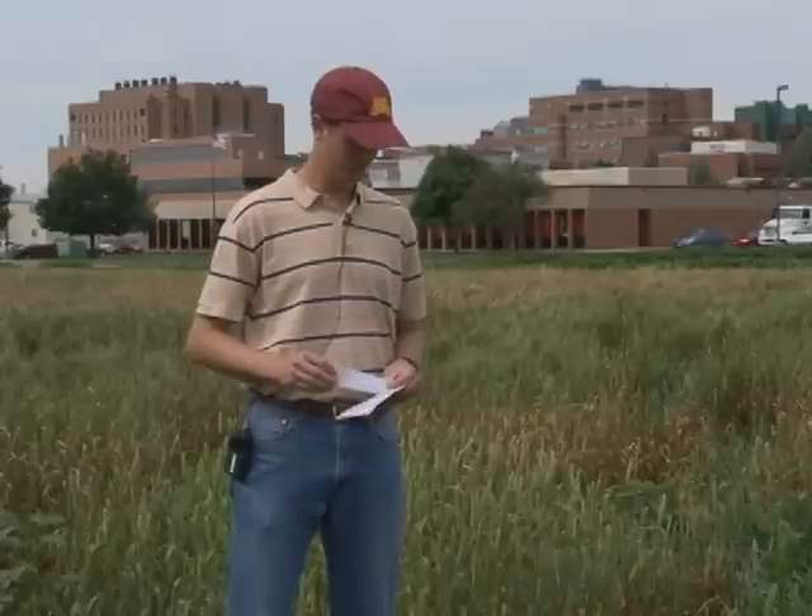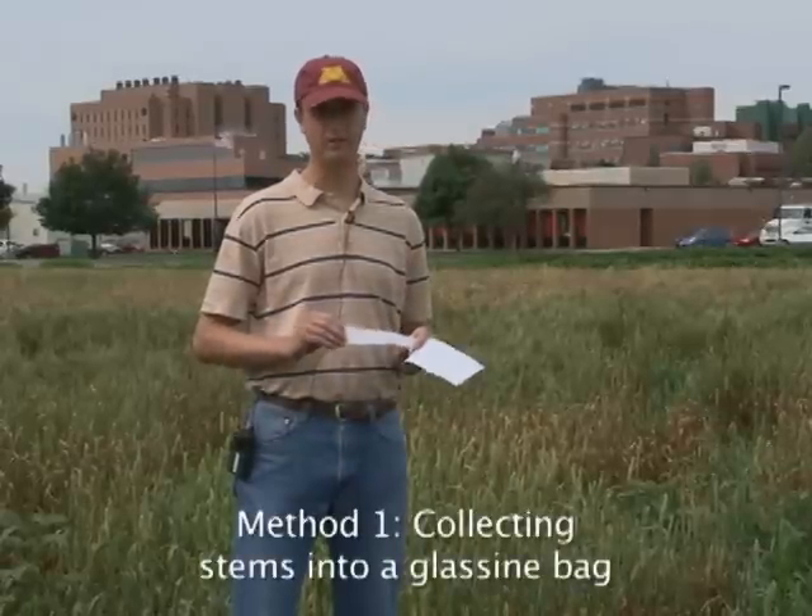I'm going to demonstrate two different methods for collecting stem rust from the field. The first method I'm going to talk about is collecting stems into a glassine bag.